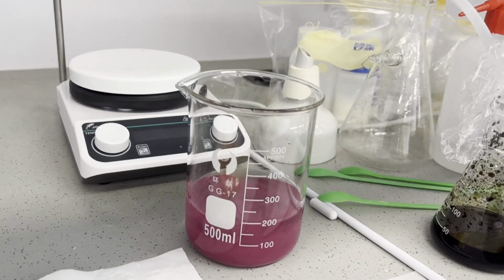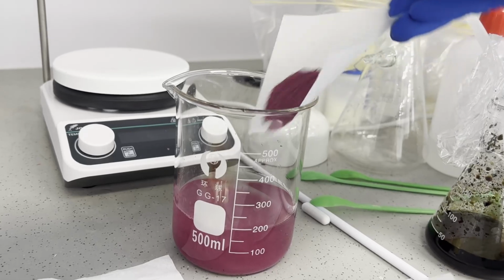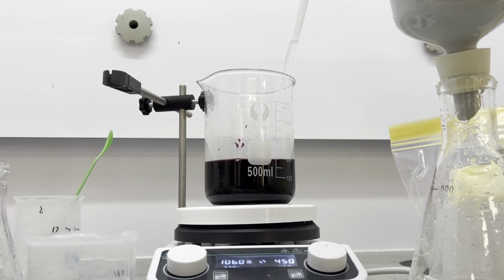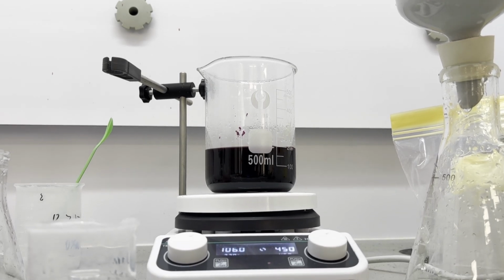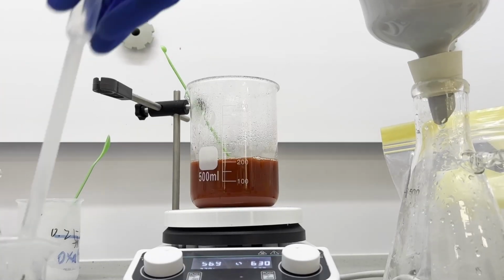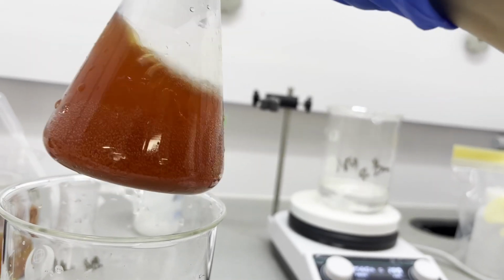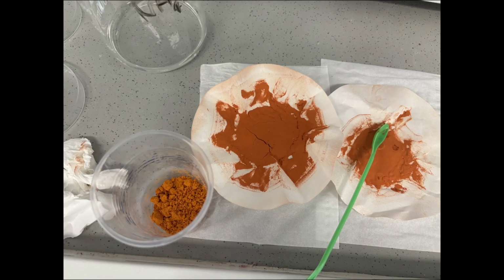I start by dissolving 10 grams of pentaamminecobalt(III) chloride in a mixture of 25 ml ammonia and 150 ml of water under slight heating, and neutralize the resulting solution with hydrochloric acid until pH equals 6. This is just to prepare a solution of pentaamminecobalt(III). 10 grams of sodium nitrite is then dissolved into the solution, and 10 ml of 20% hydrochloric acid is added. The mixture is cooled with ice for 20 minutes, and reddish-yellow crystals of the nitrito complex begin to appear, which I separate with filtration and wash with ethanol.